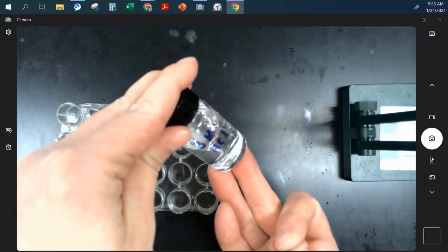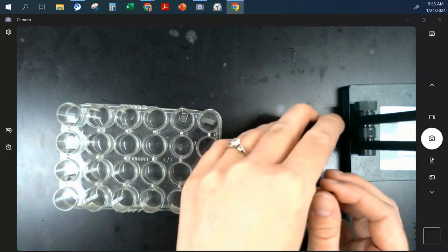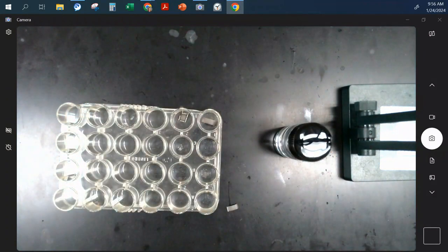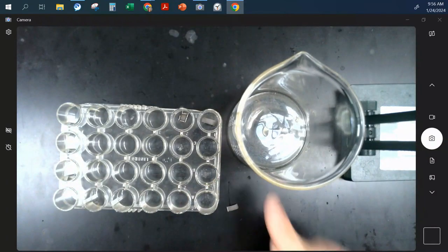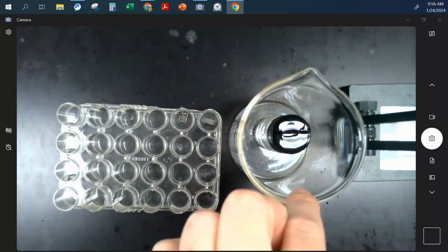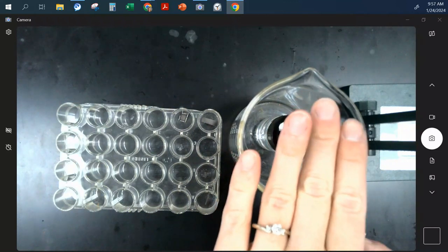Okay. One way to do that would be to change the temperature of your reactant. So if I take my reactant and put it in another beaker, imagine I'm going to take all these droppers out. I put some either ice water or hot water, just a little bit, and then I can put my reactant in there, and then this would heat up or cool down. And that could modulate the temperature of my reaction.